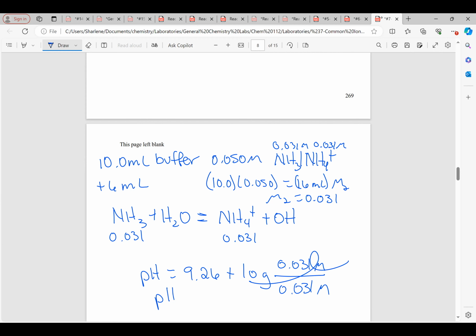The pH did not change because I diluted it, which was the take-home message.